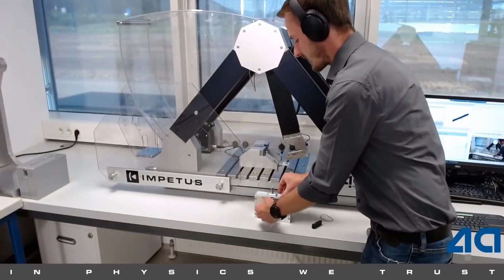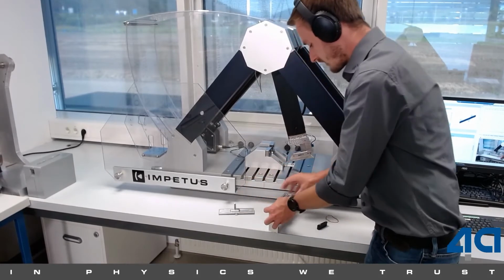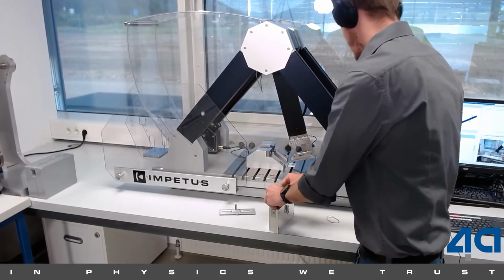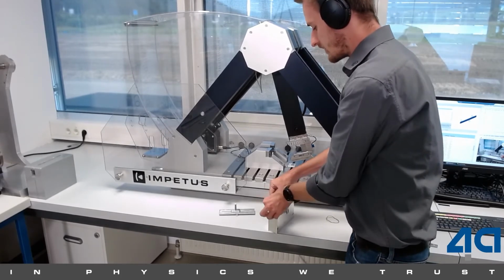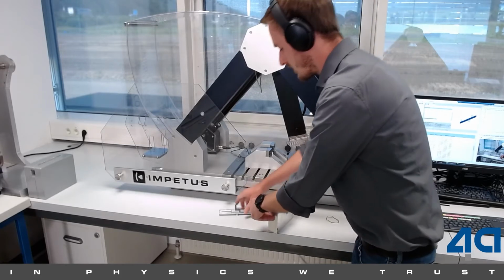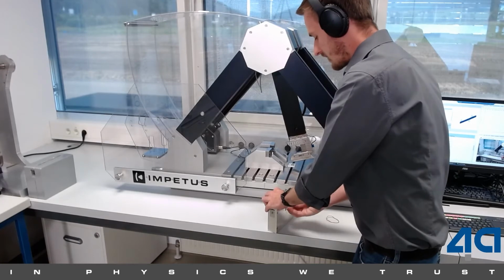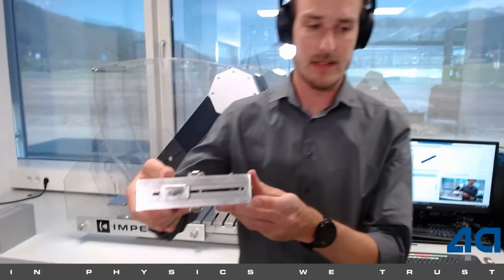Okay. So to perform the test at the high temperature, we put the samples in the correct order in our sample magazine, just like that. The whole setup. After that, we are closing the magazine. And now here you can see the samples in it.